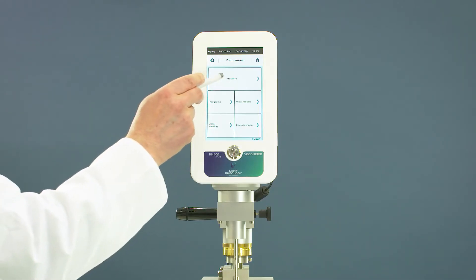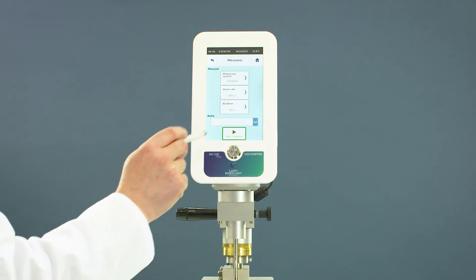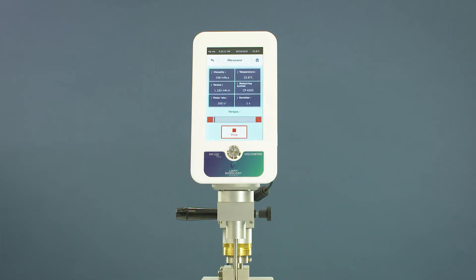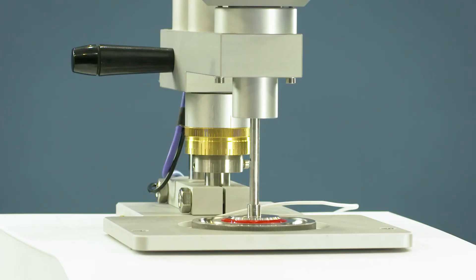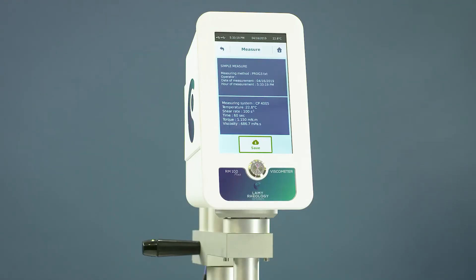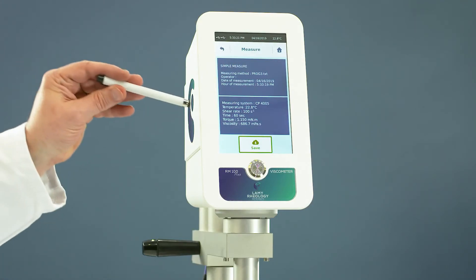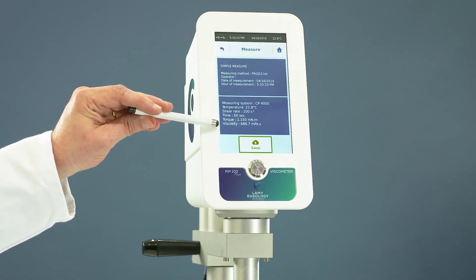Go to measure, select your method and start your measurement. At the end, the device shows all results obtained. You can save it.